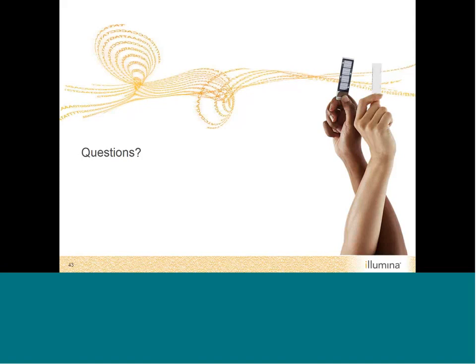Another question, can I directly compare data analyzed on the MiSeq with data streamed to BaseSpace? The apps on BaseSpace are similar to the workflows in MSR on the MiSeq, but they're not identical. These are separate analysis options. They each have their own settings and their own workflow guides. So they are similar, but you want to make sure that you chose the right settings, keeping in mind that these are separate workflows.